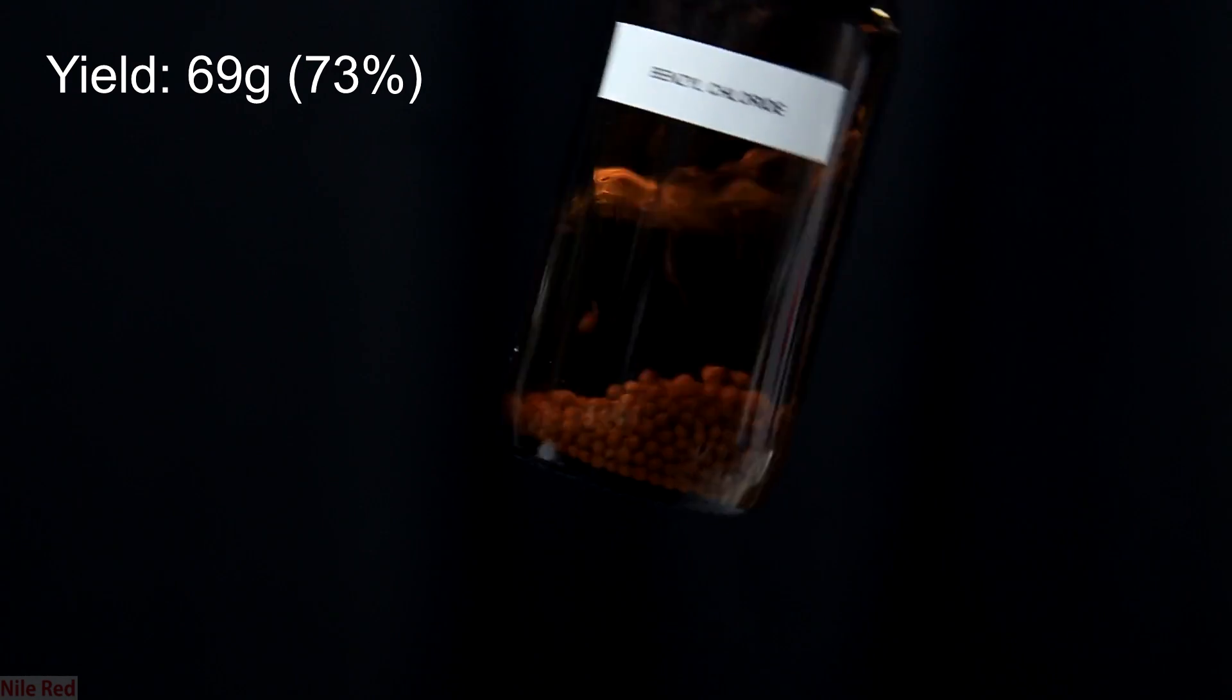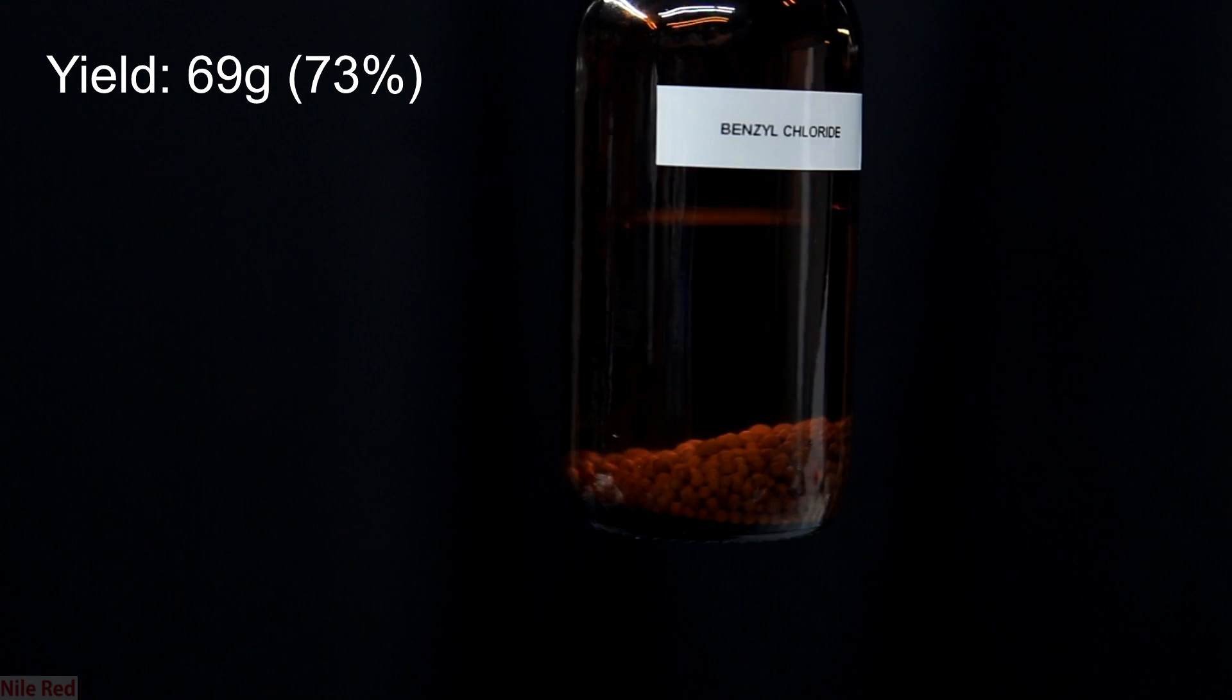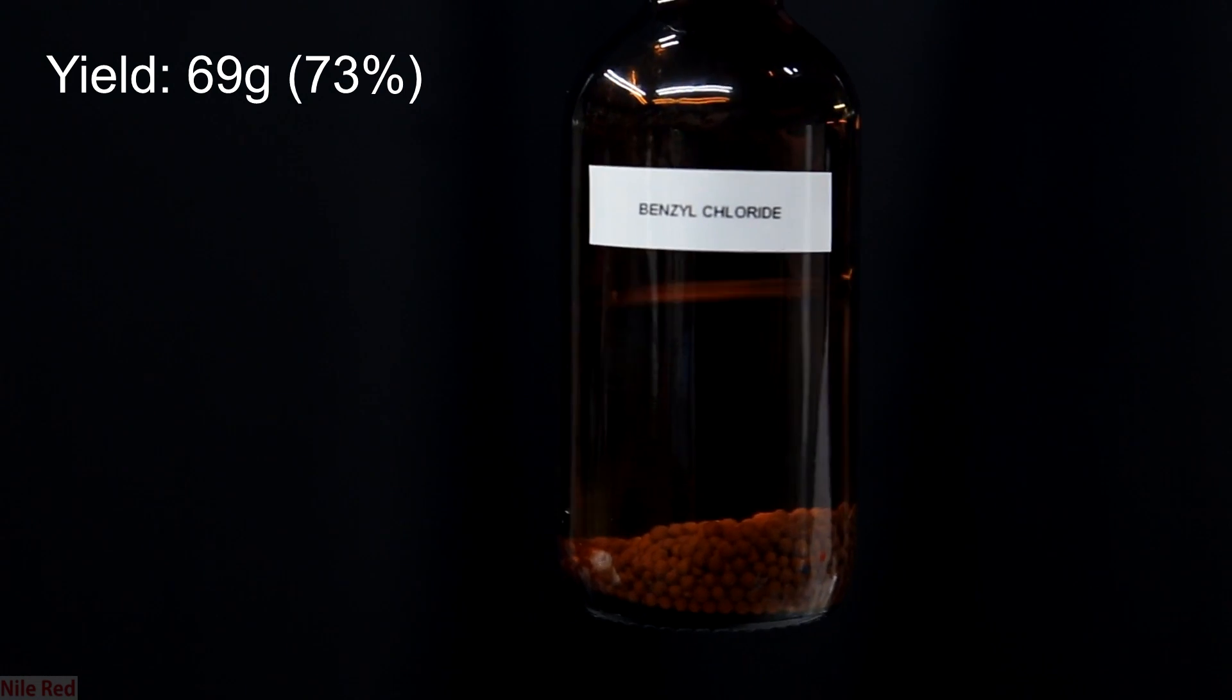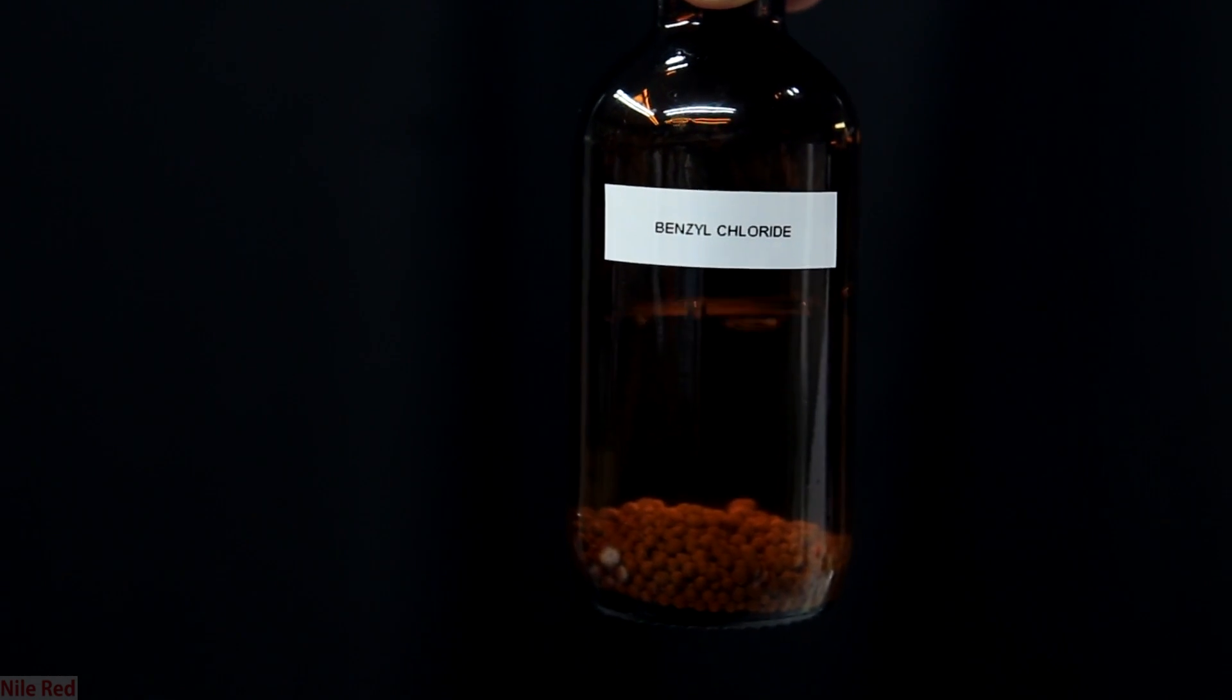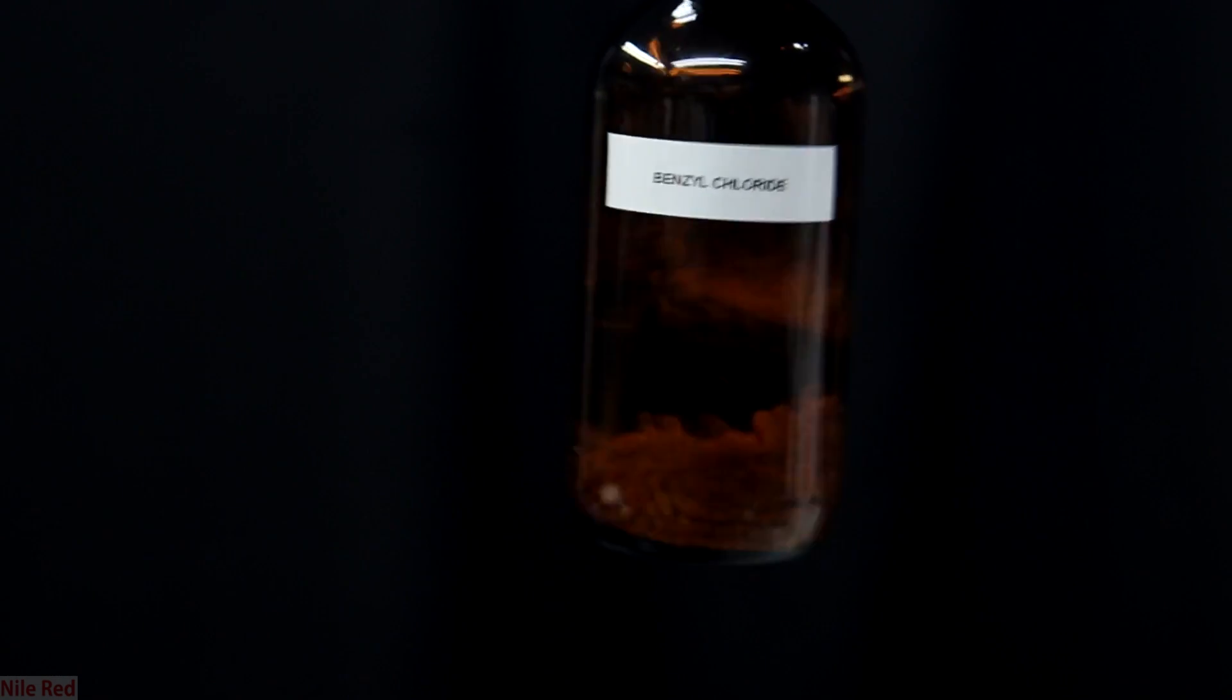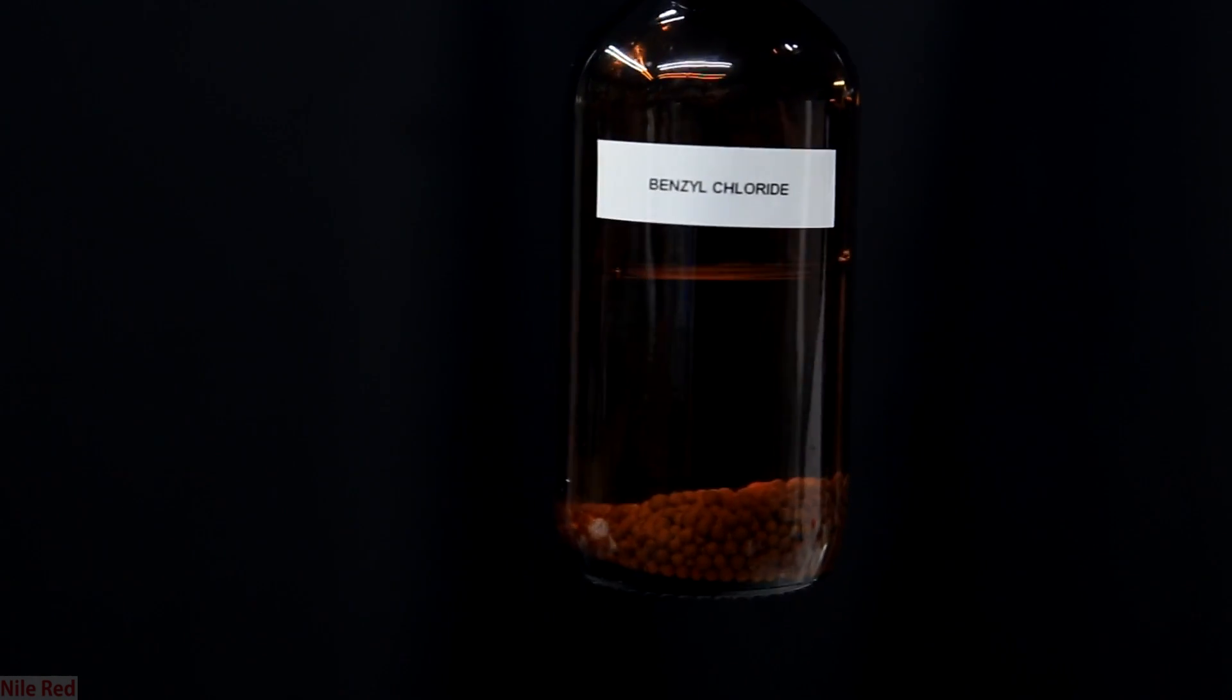So in the end the final yield was 69 grams of benzyl chloride. This corresponds to a yield of about 73% which is pretty much expected. As I said before I'll be using the benzyl chloride to make denatonium benzoate and I'll post this in a future video. I already filmed it but I filmed it with my new camera and I'm trying to get all of the footage that I filmed with my old camera out first.